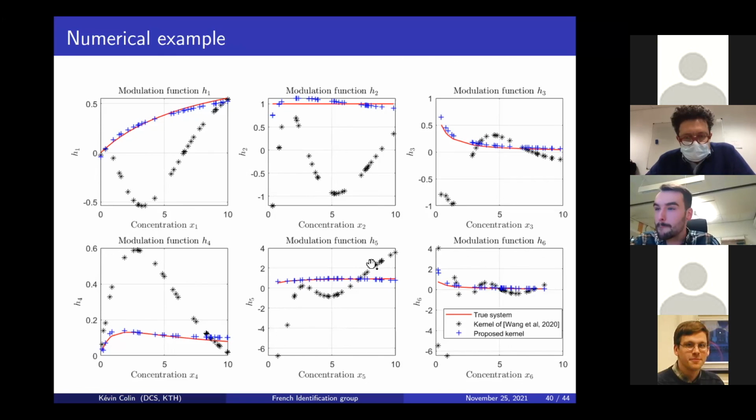But it's already quite impressive, especially if you have only 10 points. I don't understand how it is really possible to estimate, from 10 points of data... No, no, 12 parameters? It's 30. Here on the axis is the concentration amplitude. Okay, yeah, but it's still very impressive.